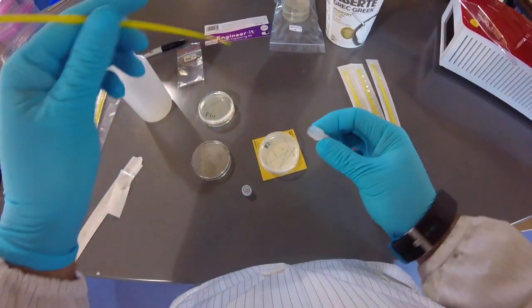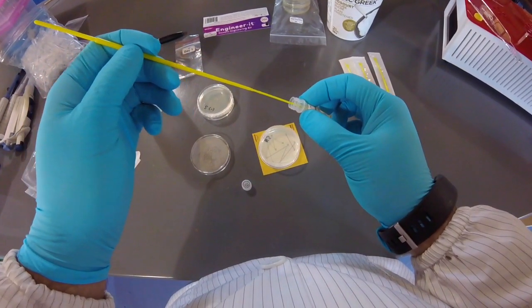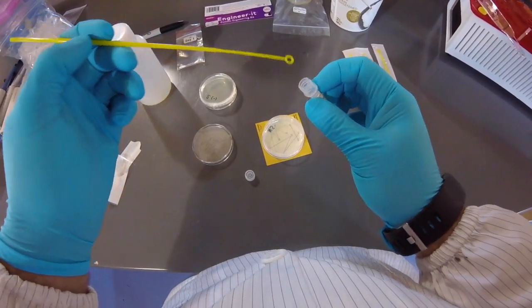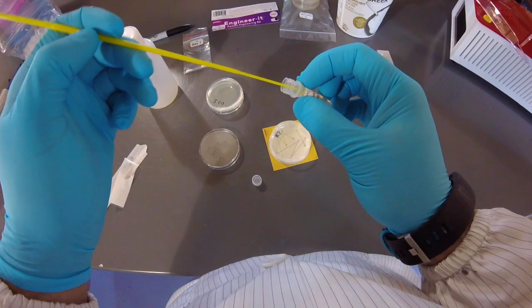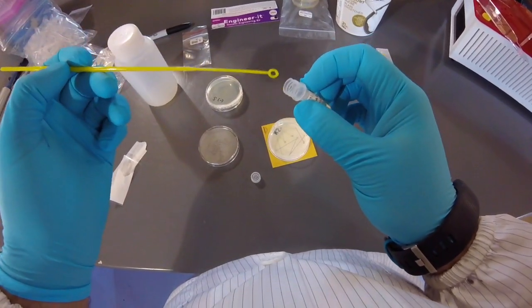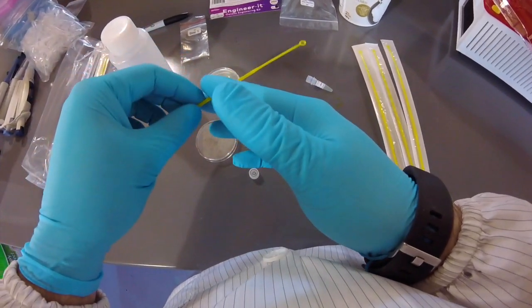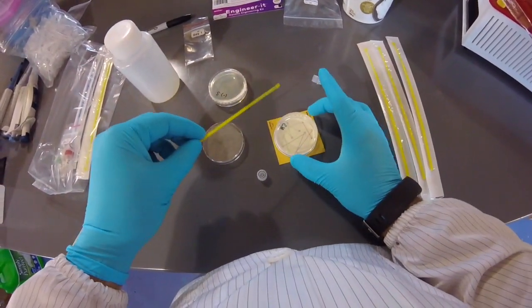Open this tube, and again, you're just going to dip it in gently a few times. You don't go too deep, you don't need to scoop. If you look at it and it's wet, which mine is wet, then you know you've touched the bacteria inside and you're ready to streak, okay?